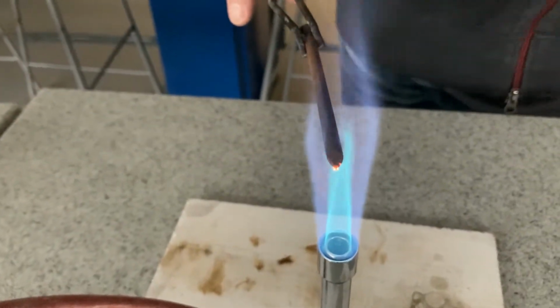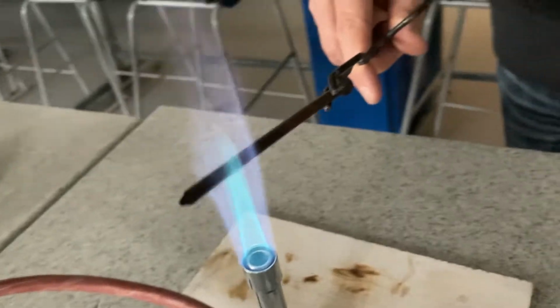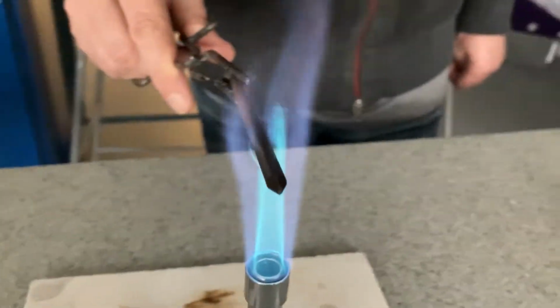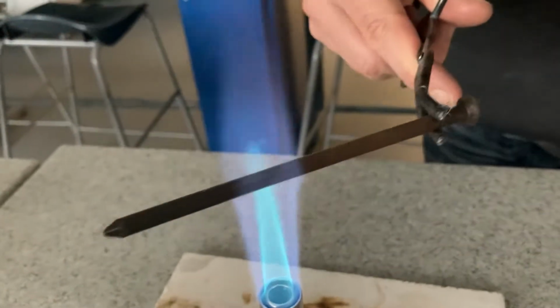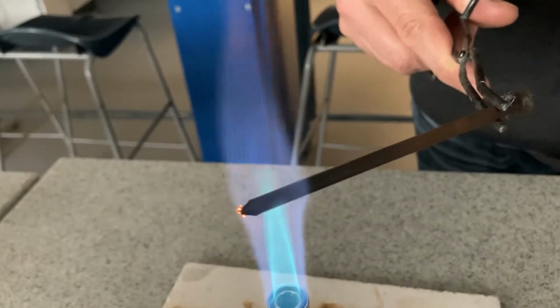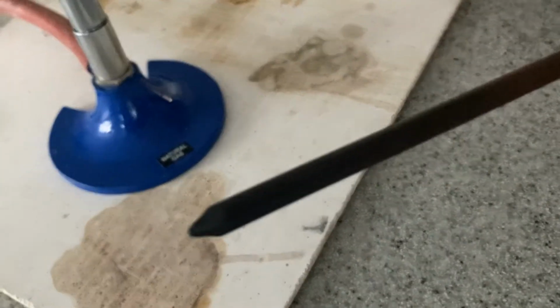Pop that there. Right, let's give it a go. This iron. Big chunk of iron. Pop it in there. Well, there's not a lot happening with this. Actually, that might be because it's such a big chunk and the heat can just conduct away down it. It might be stopping it reacting, I don't know. Let's have a look at it. Well, I think it's gone dark at the end. The one end's darker than the other.